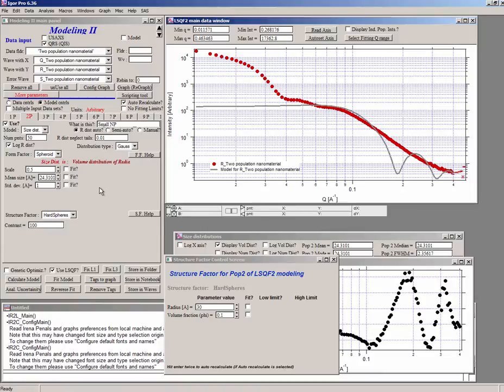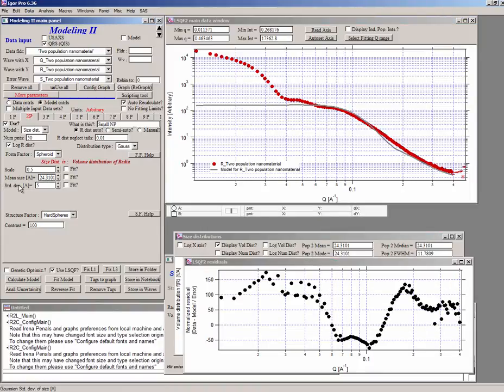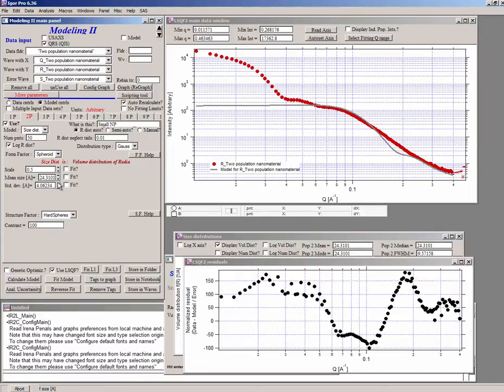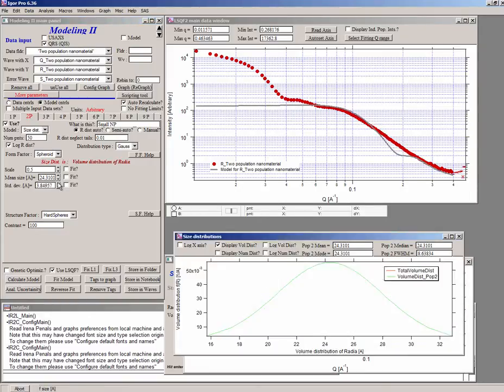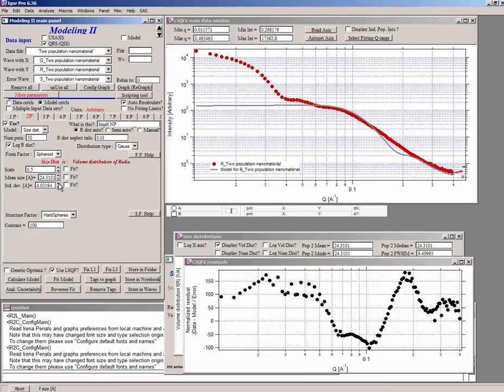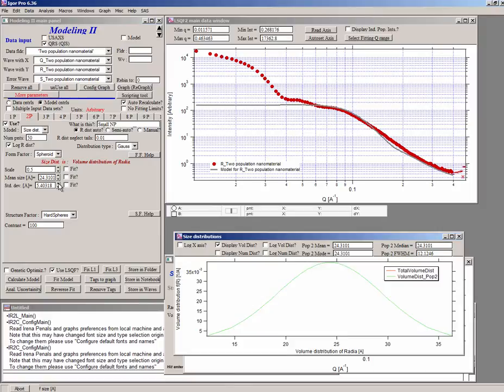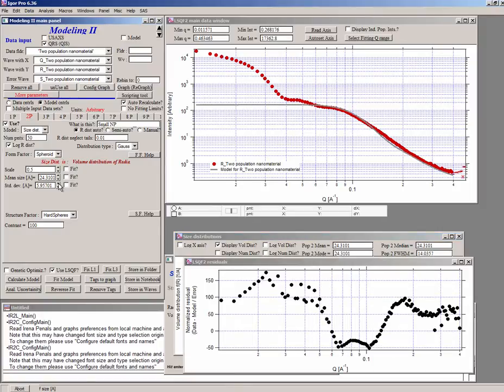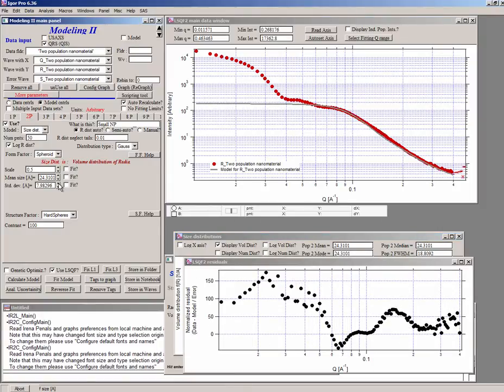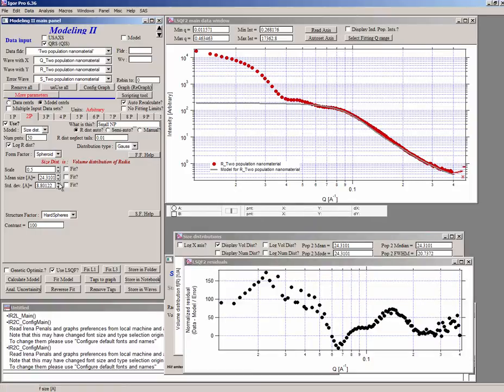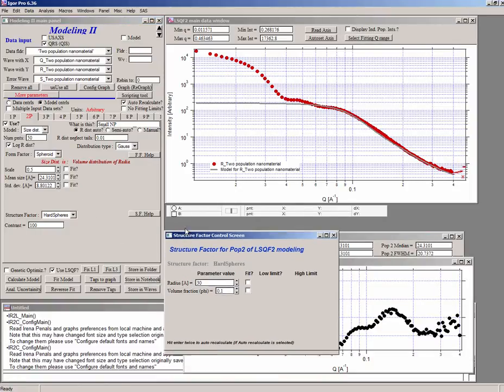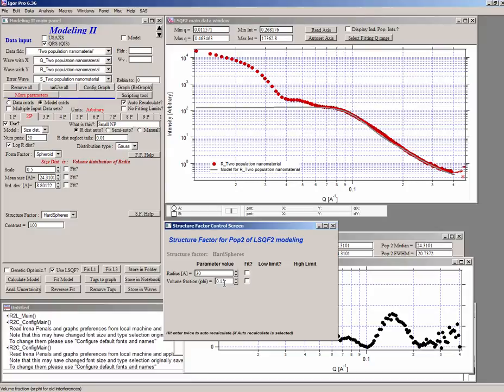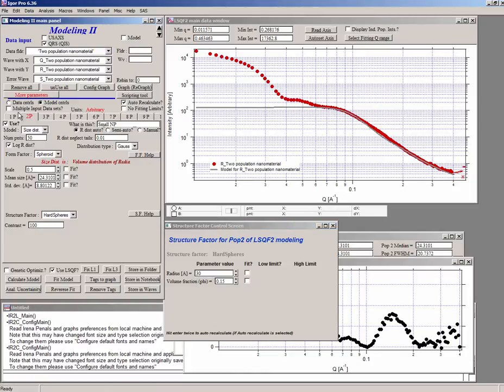So with this, you can actually modify the shape of the curve in such a way that it's much closer to what we have as the measured data. So what we want to do is make this wider, maybe more. Oh, the other way. So here is a good guess. Make this one 0.15. That's going to make the shape of this curve sharper. So now, with this, we can start doing some fitting.